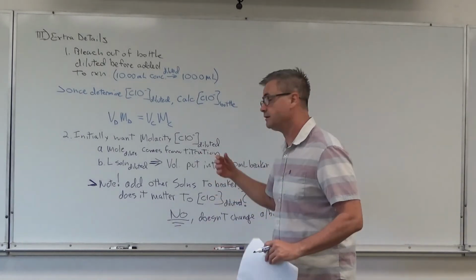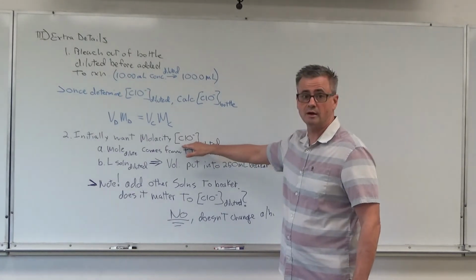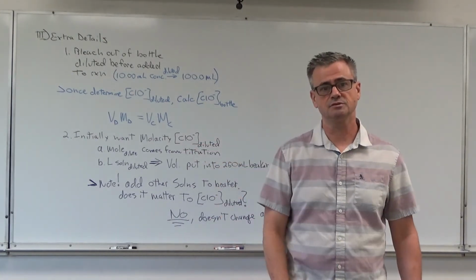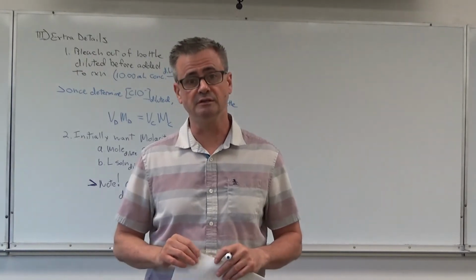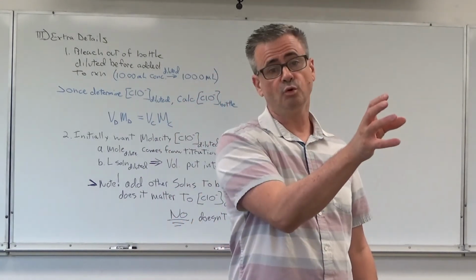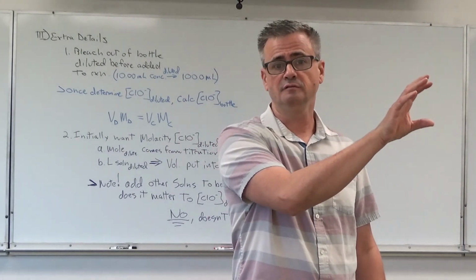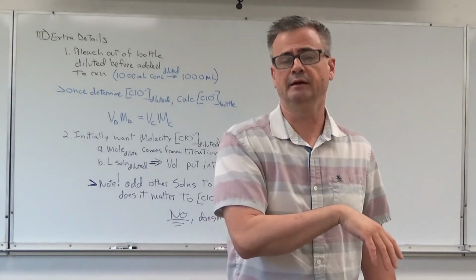When you're talking about molarity, you don't have to worry so much about the sodium, because the molarity of sodium is exactly the same as the molarity of sodium hypochlorite, since there's one sodium for every one of those, so it doesn't change. But when you're figuring out the mass percent, you do need to include the sodium. So if you know the number of moles of sodium hypochlorite, you can convert that into mass of sodium hypochlorite using the molecular weight of sodium hypochlorite. You can calculate that out by hand, or you can get it from the internet, I don't care.